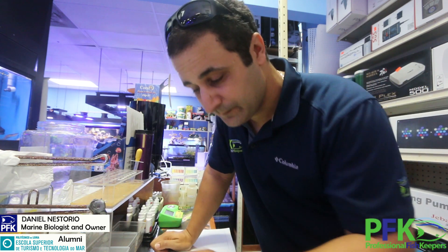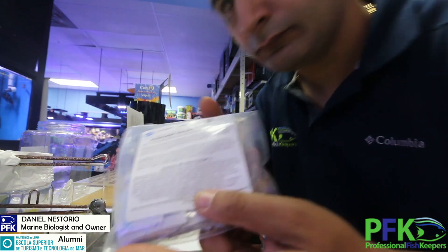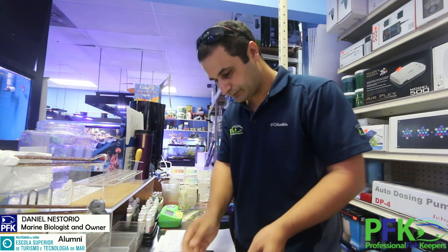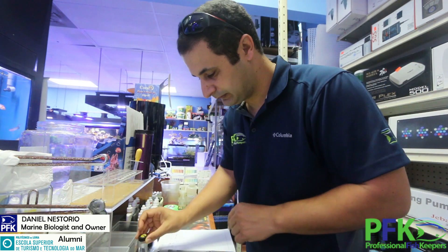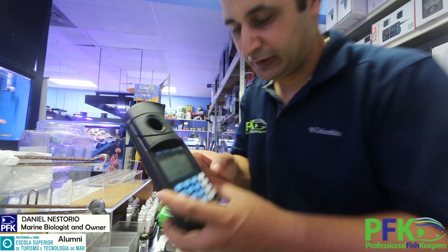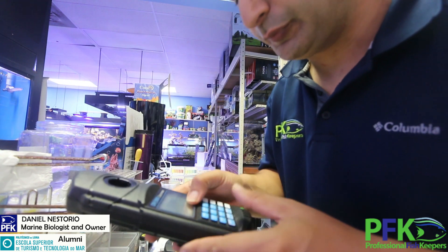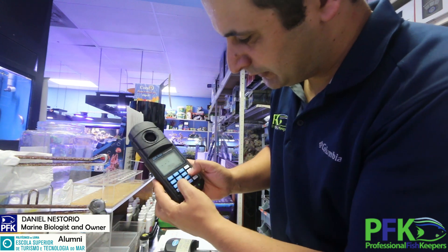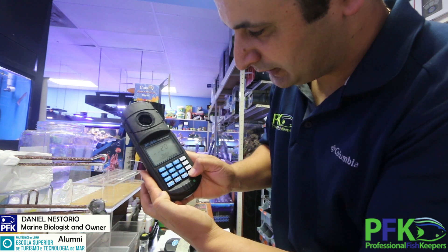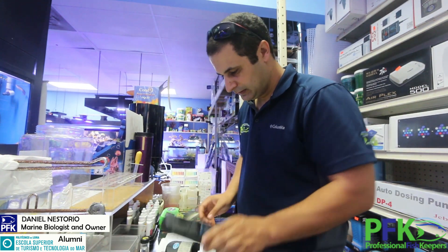For hard water, you want to use Copper Number Two reagent. Fill the blank tube all the way to 25 milliliters, then turn it on. It's already on the copper program, but you go to program number 20 — press program, enter 20, press enter. That means copper.